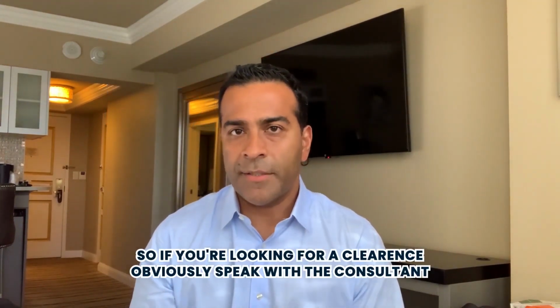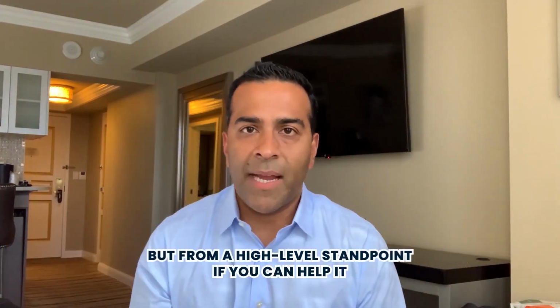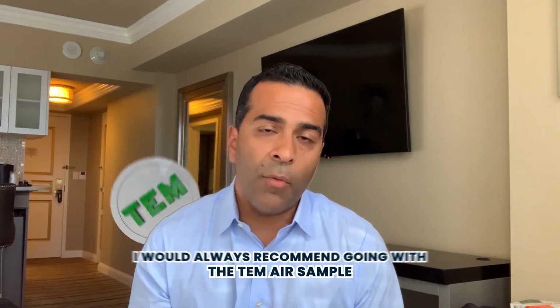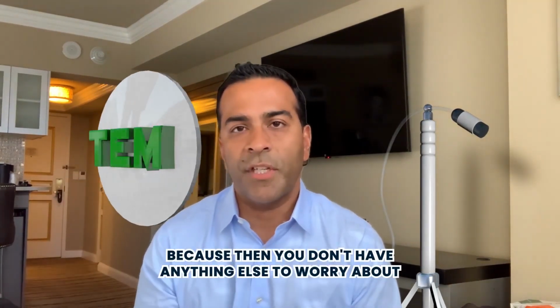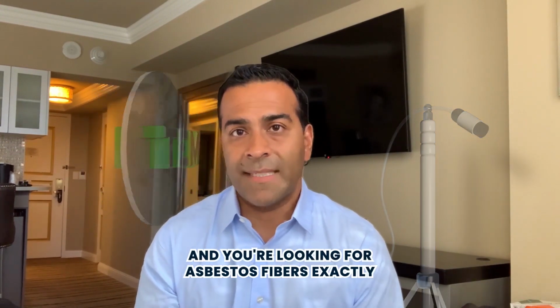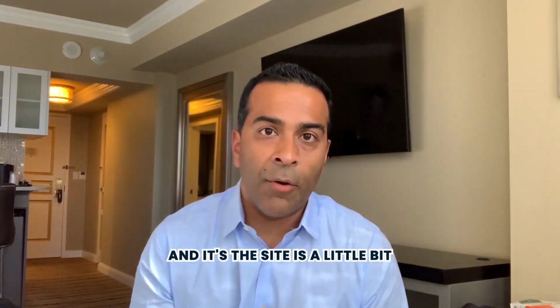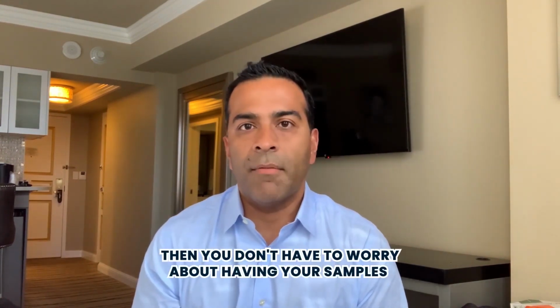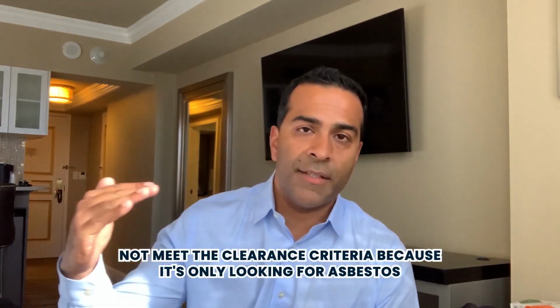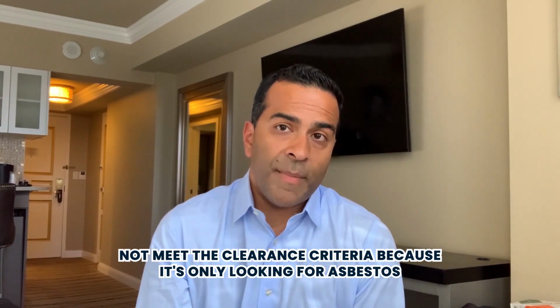So if you're looking for a clearance, obviously speak with the consultant, but from a high-level standpoint, if you can help it, I would always recommend going with the TEM air sample, because then you don't have anything else to worry about and you're looking for asbestos fibers exactly. And if the site might have other types of dust in the environment, you don't have to worry about your samples not meeting the clearance criteria, because it's only looking for asbestos.